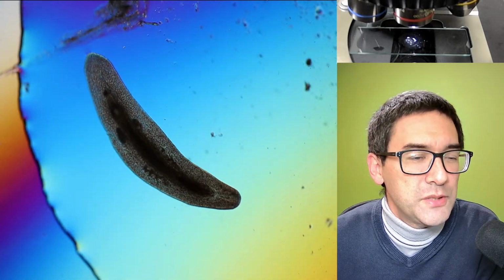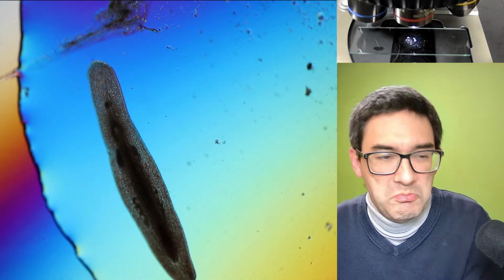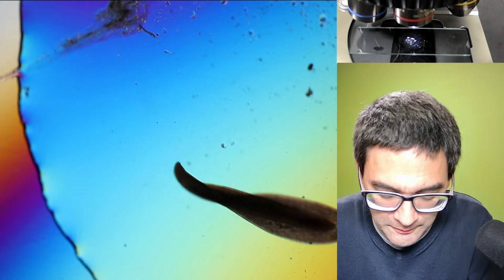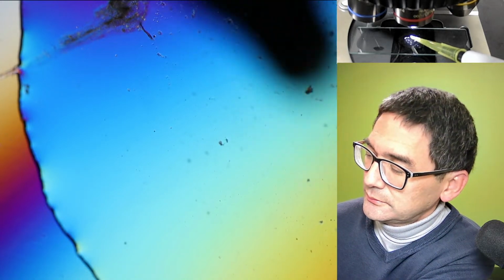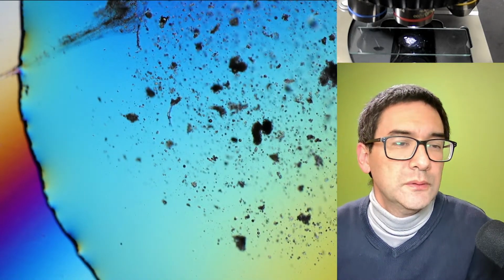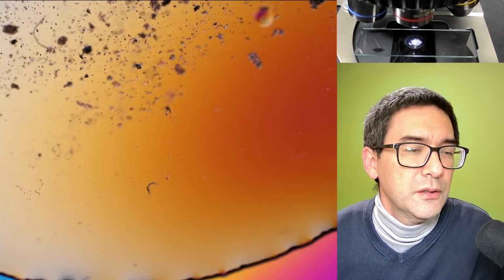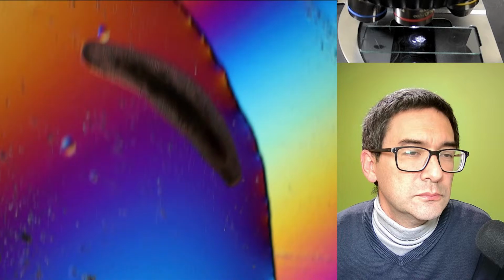Yeah, so the flatworm seems to be doing reasonably fine here. So maybe, you know what? I'm going to go up with the concentration yet a little bit further. So I'm going to pick up a little bit more of this. And let's add some more. Here we go. And where is the flatworm? Yeah, the nematode is here. And where is the flatworm? Here it is.